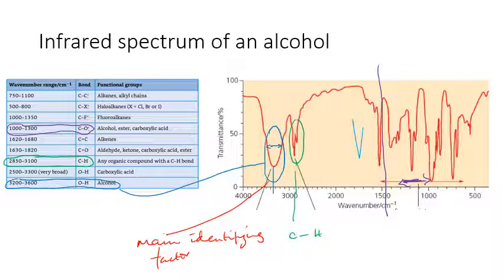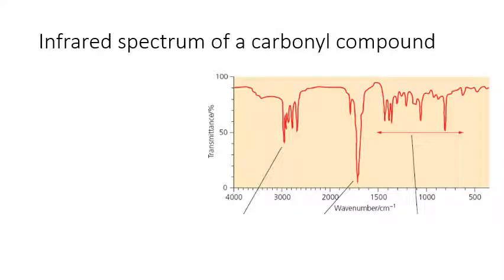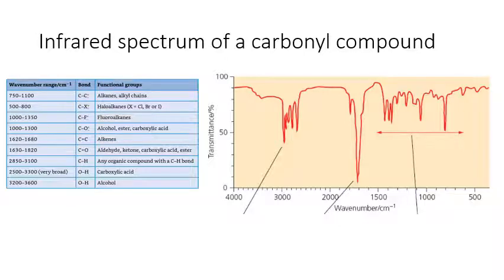Let's move on to another functional group. This is a spectrum of a carbonyl compound, and let's have a look at it along with the data table.